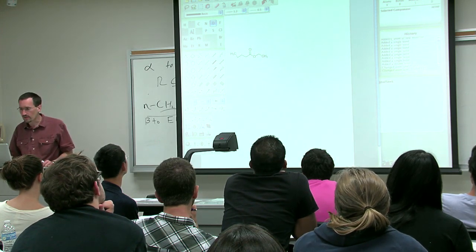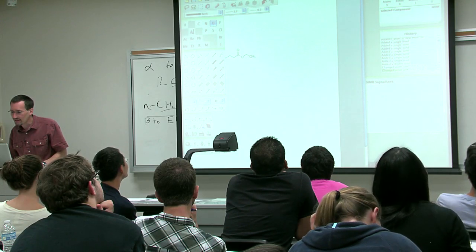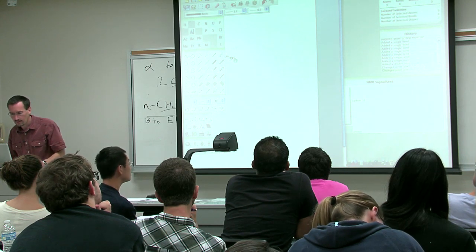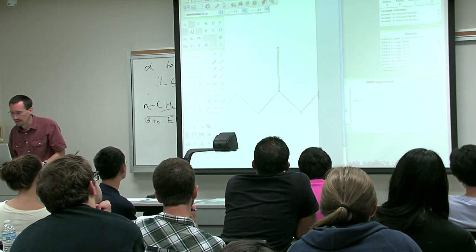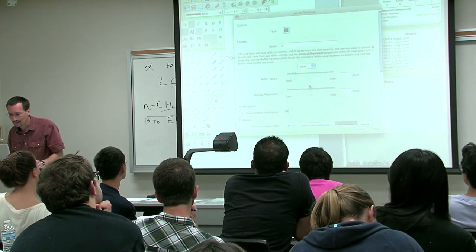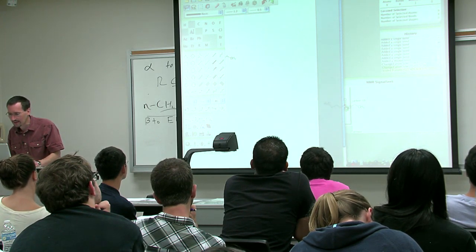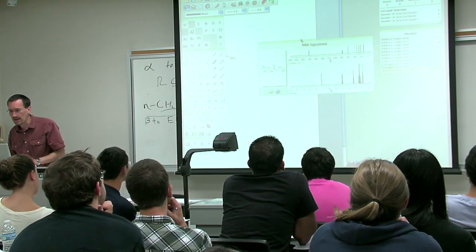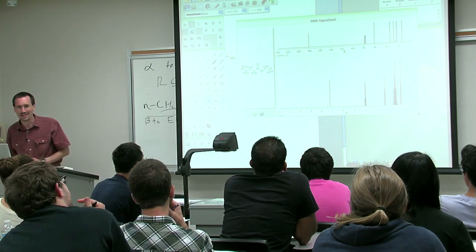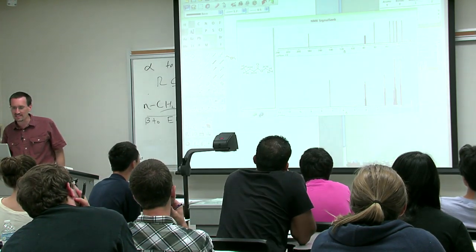All right, so here's a rather disappointing drawing of ethyl pentanoate. And if I can drag this right over here. So that is a simulator that's doing essential, what? Oh, no, never mind, that's a solvent. So it does have chloroform in there. There are a bunch of silly settings on this thing.